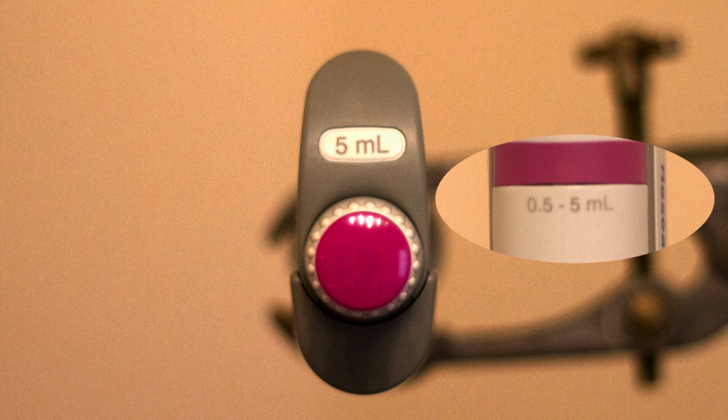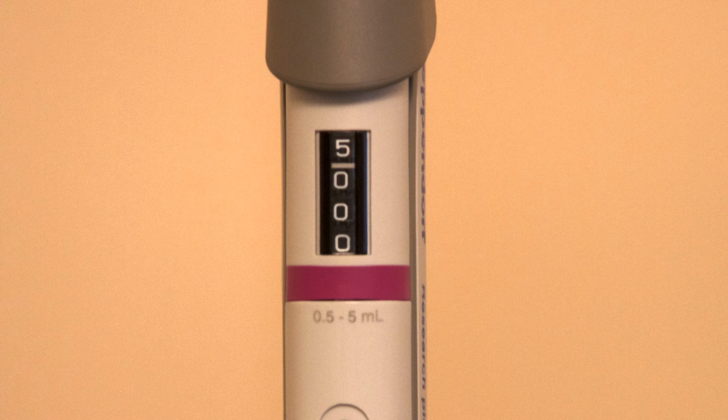Therefore, the largest volume this pipette can dispense is 5 millilitres or 5000 microlitres, and the smallest volume is 0.5 millilitres or 500 microlitres. 5 millilitres is shown on the side window display as 5, 0, 0, 0. In terms of microlitres, the upper number is thousands, followed by hundreds, then tens, and finally units.